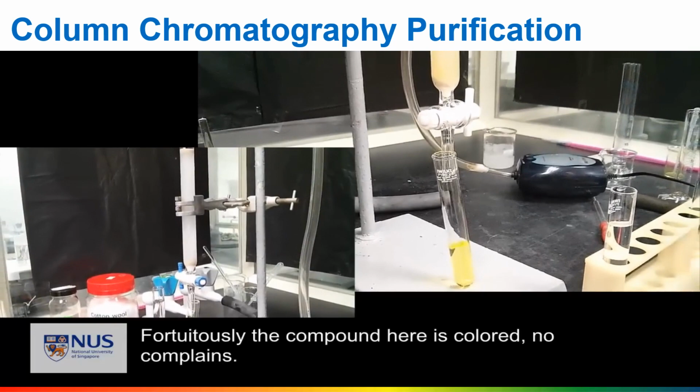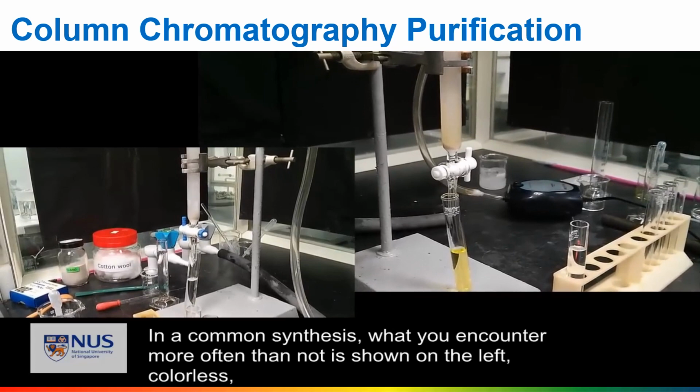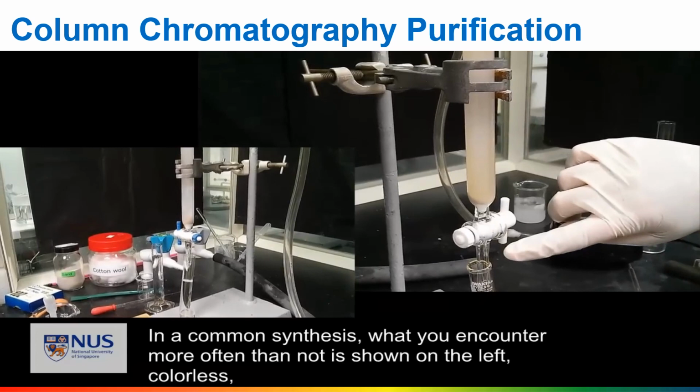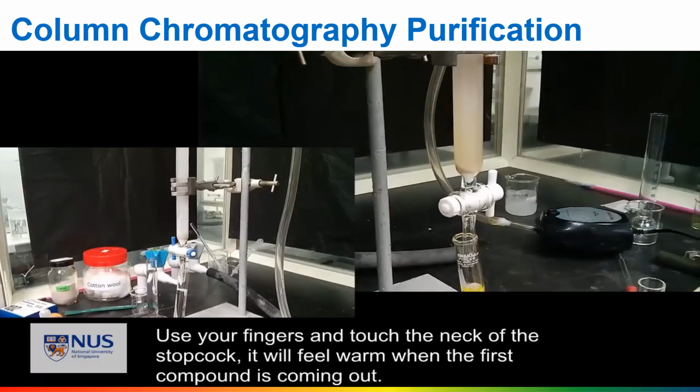Fortuitously, the compound is colored here, so there's no complaints. We collect all those in yellow in the same fraction. In a normal synthesis, what you encounter more often than not is shown on the left, all colorless. So how do you gauge if the first compound has eluted? Use the fingers and touch the neck of the stopcock. It will feel warm when the first compound is coming out.